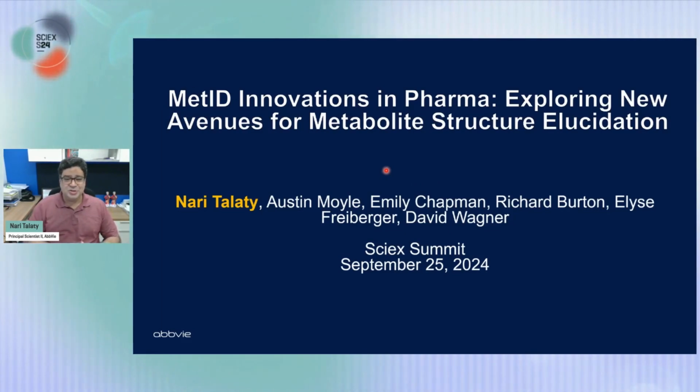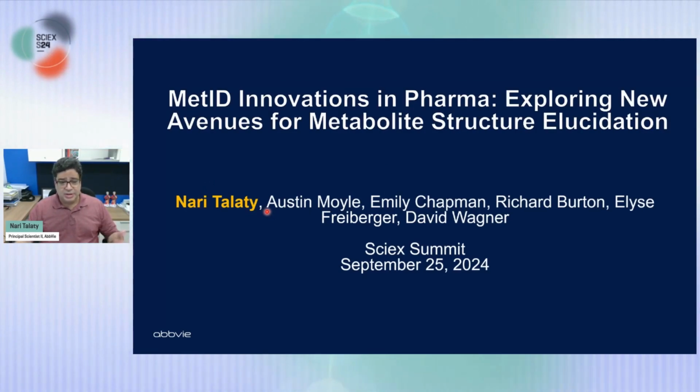I've been a Sciex user for a long time. I've worked with their triple quads, and even the QTRAP Elite with a MALDI on it, and did some imaging work earlier. And now I have the pleasure of working on the 7600 ZenoTOF. So I'm going to talk about some of the work we've been doing at AbbVie. This is, again, preliminary work. We have really started to explore the full potential of this system.